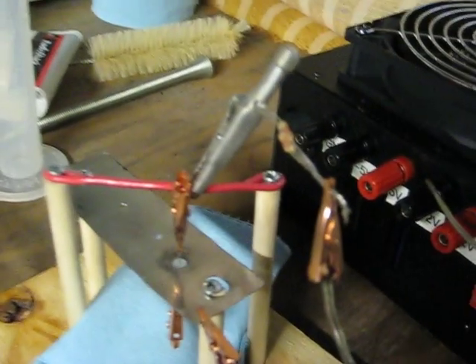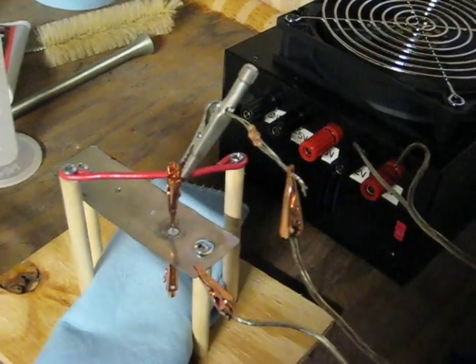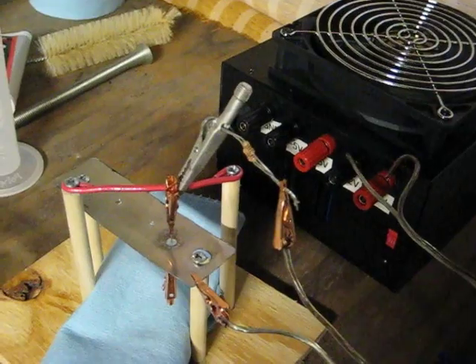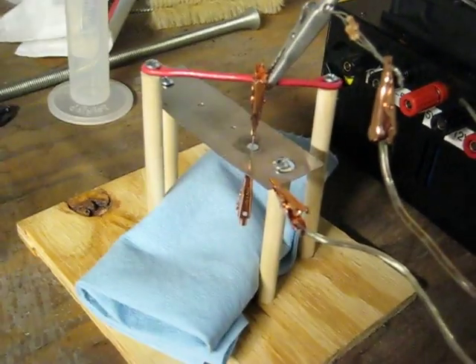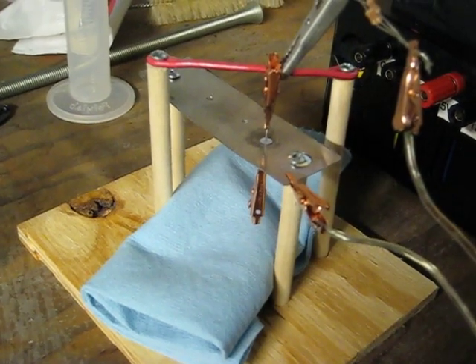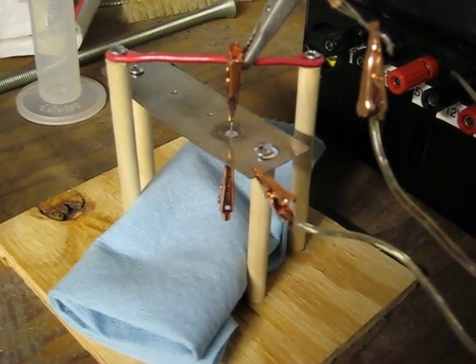Over here is my jerry-rigged power resistor — it's about a 330 ohm resistor, basically three one kilohm resistors put in series. I'll take some more shots in a little bit.